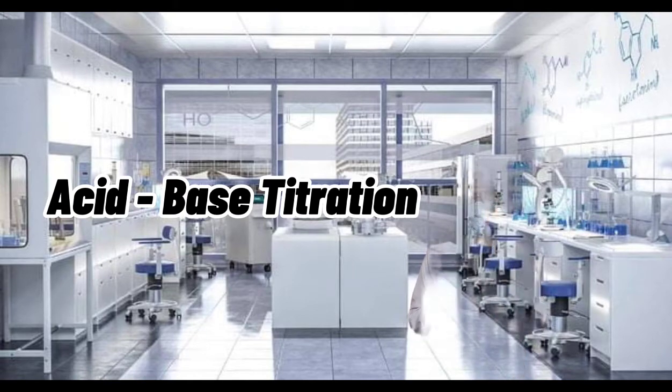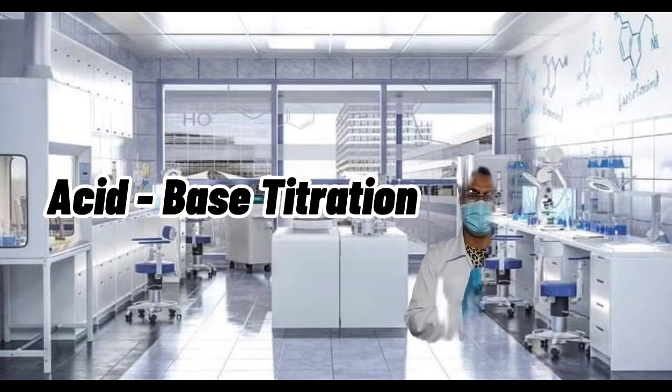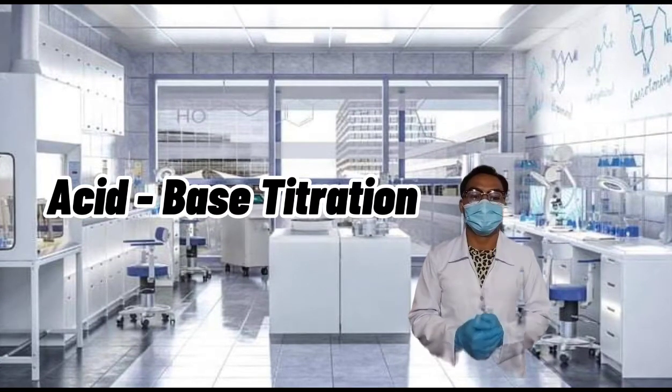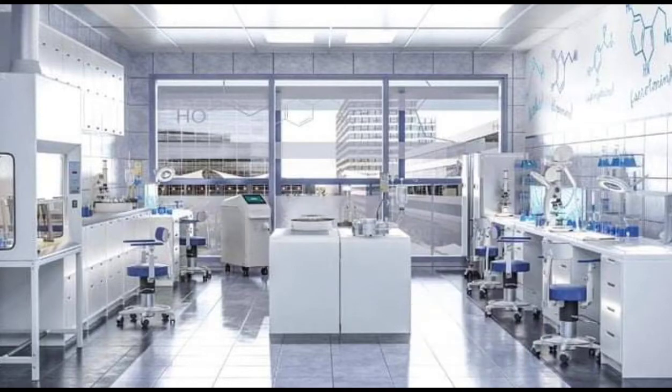An acid-base titration is a method of quantitative analysis for determining the concentration of an acid or base by exactly neutralizing it with a standard solution of base or acid having known concentration. Acid-base titration is a way of determining how much acid or base is present in the solution by determining the volume of acid or base that completely reacts with the other.